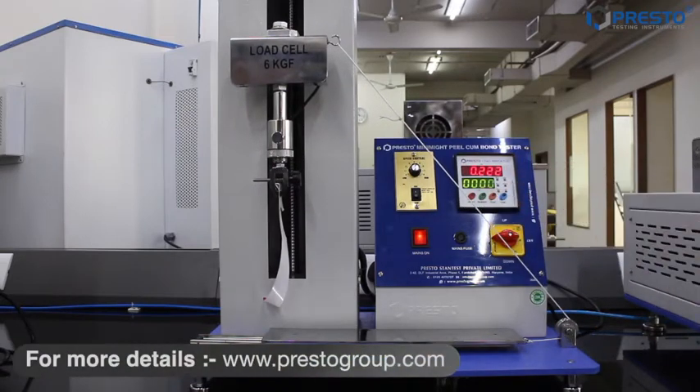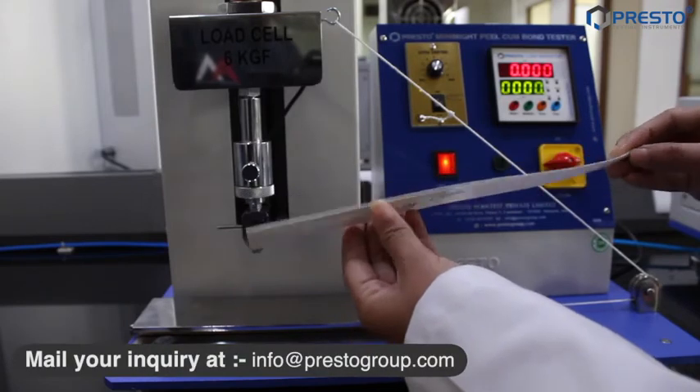The maximum load value is 222 grams per 25 mm. Now testing SSP sample 1000 ml.